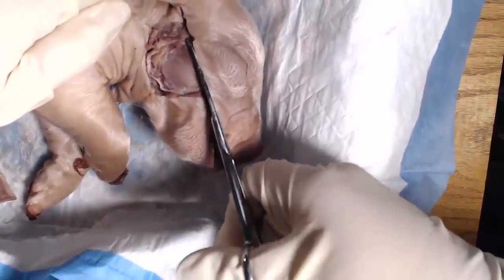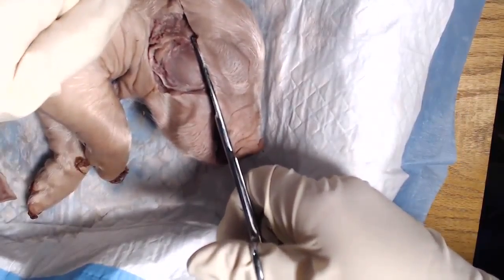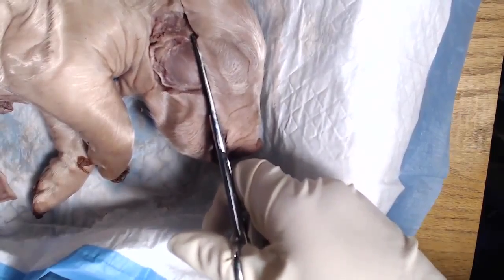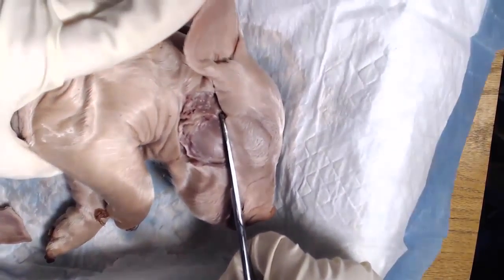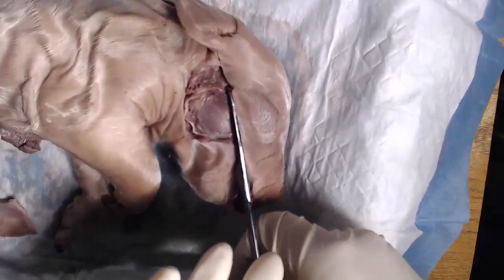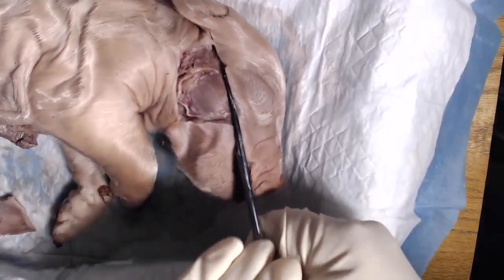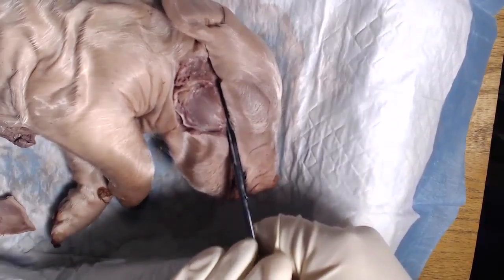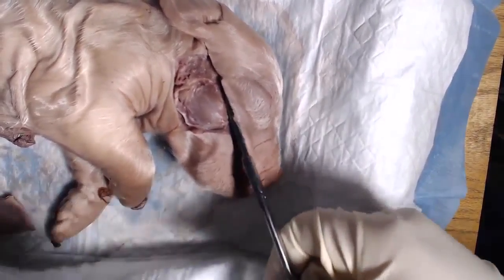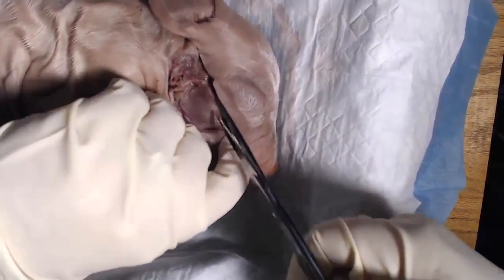All right, so I'm under the muscle and the bone here with this, and I'm about to make my cut through the bone. You can see how my scissors are pointing towards the pig's ear. That's the trajectory you want. And that loud click was me cutting through the bone. Didn't take too much force, but it's definitely harder than cutting through the skin.